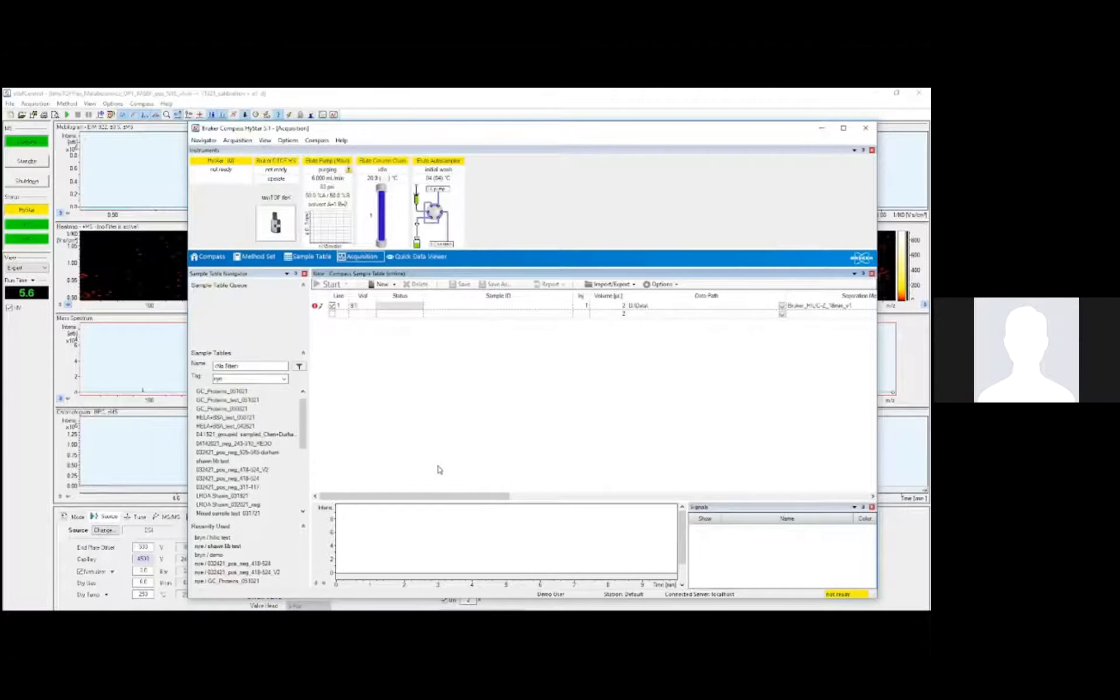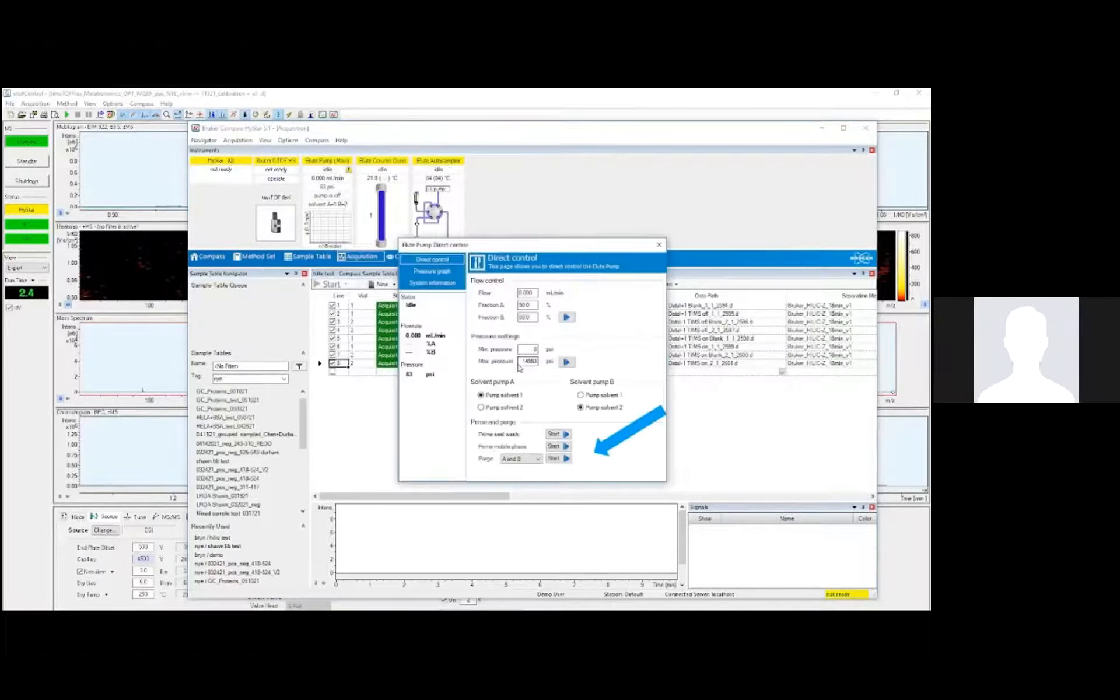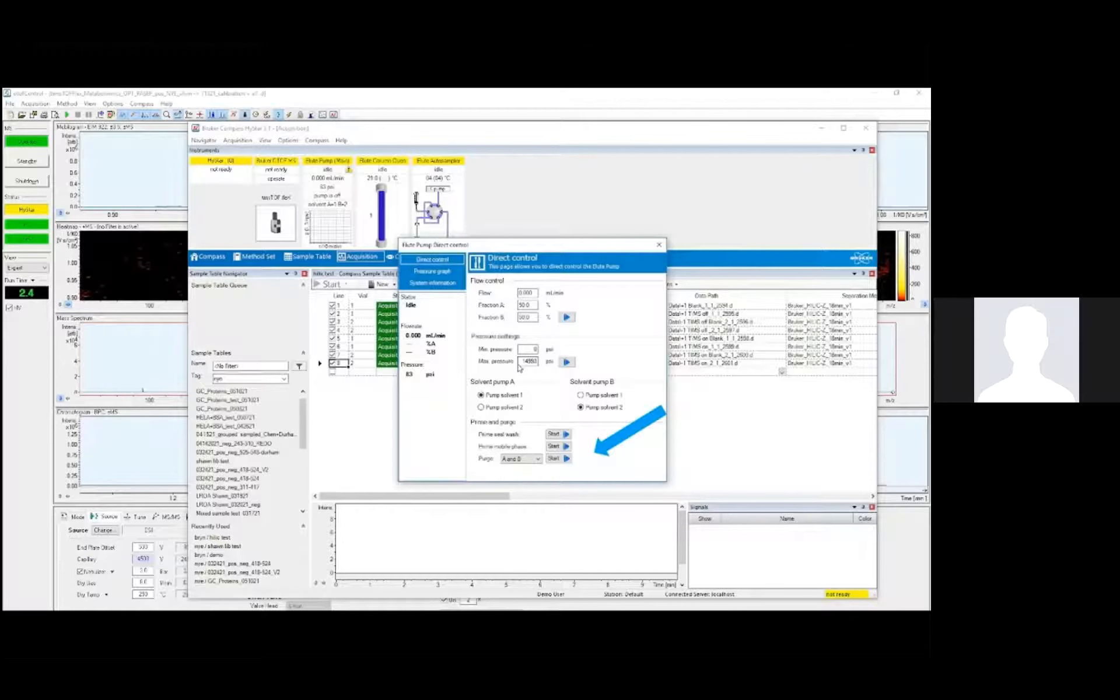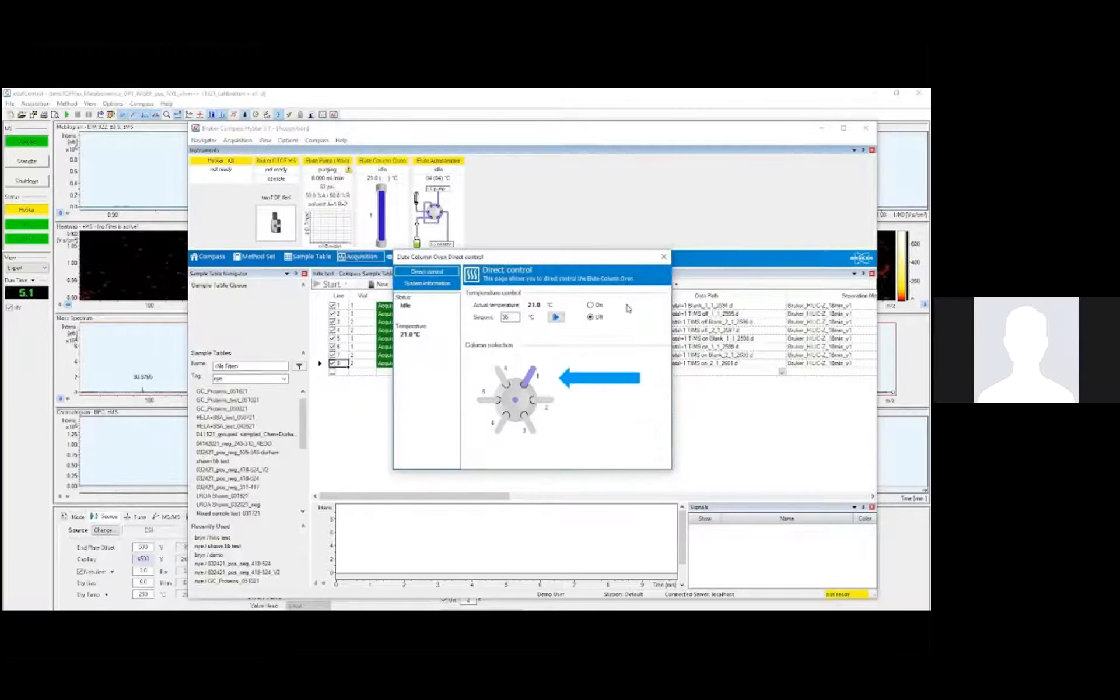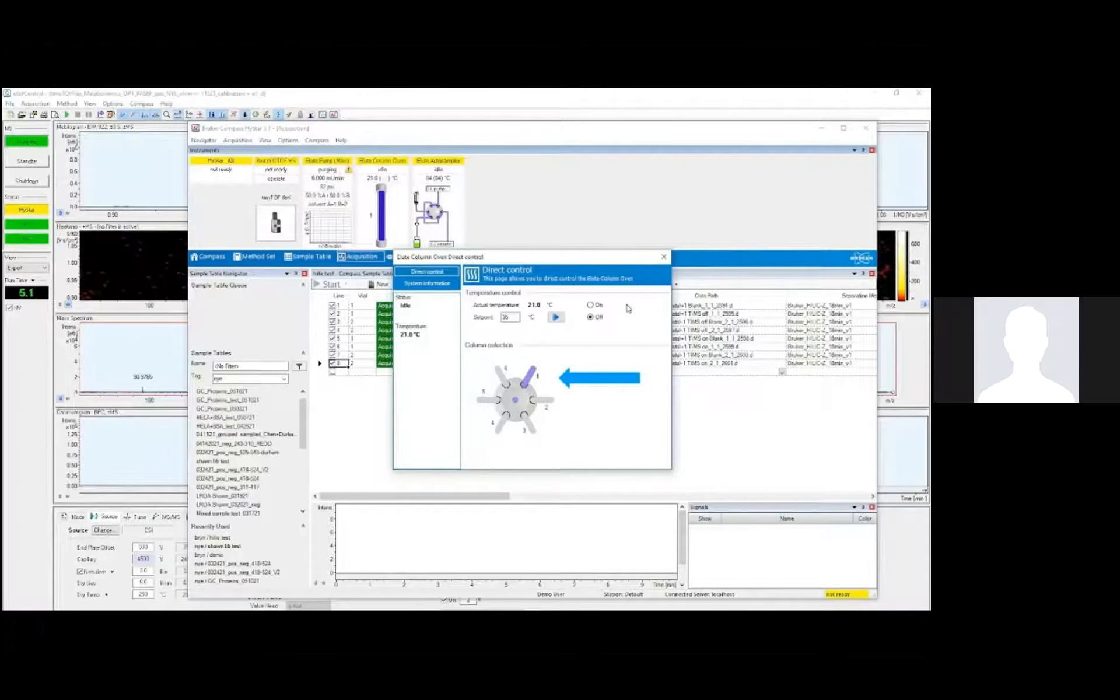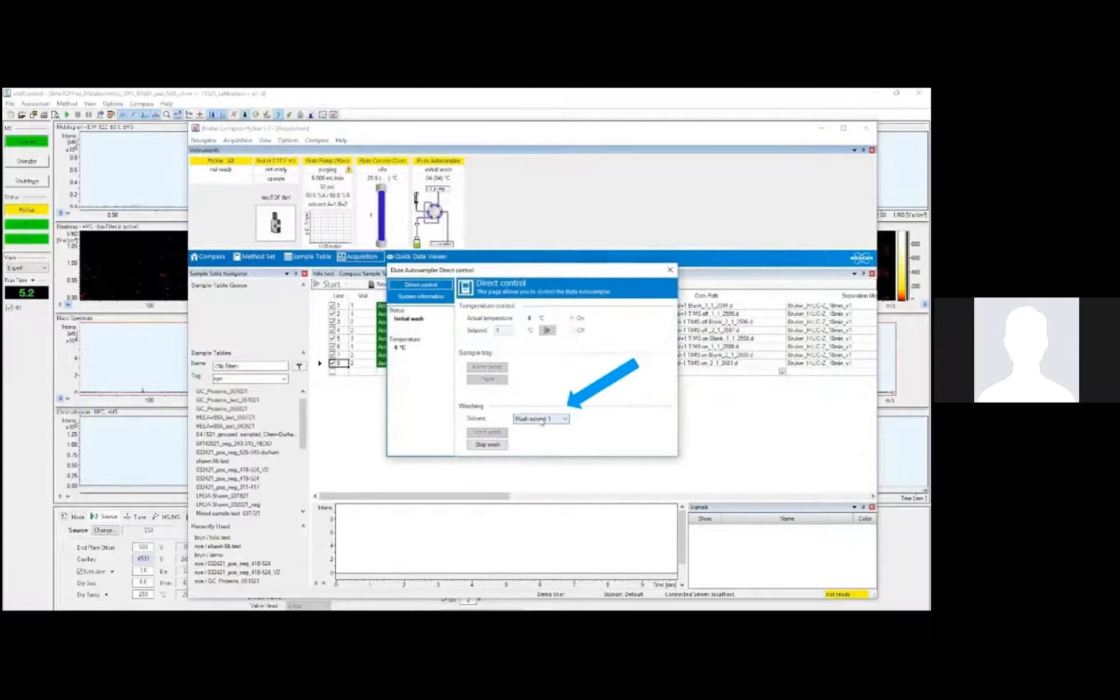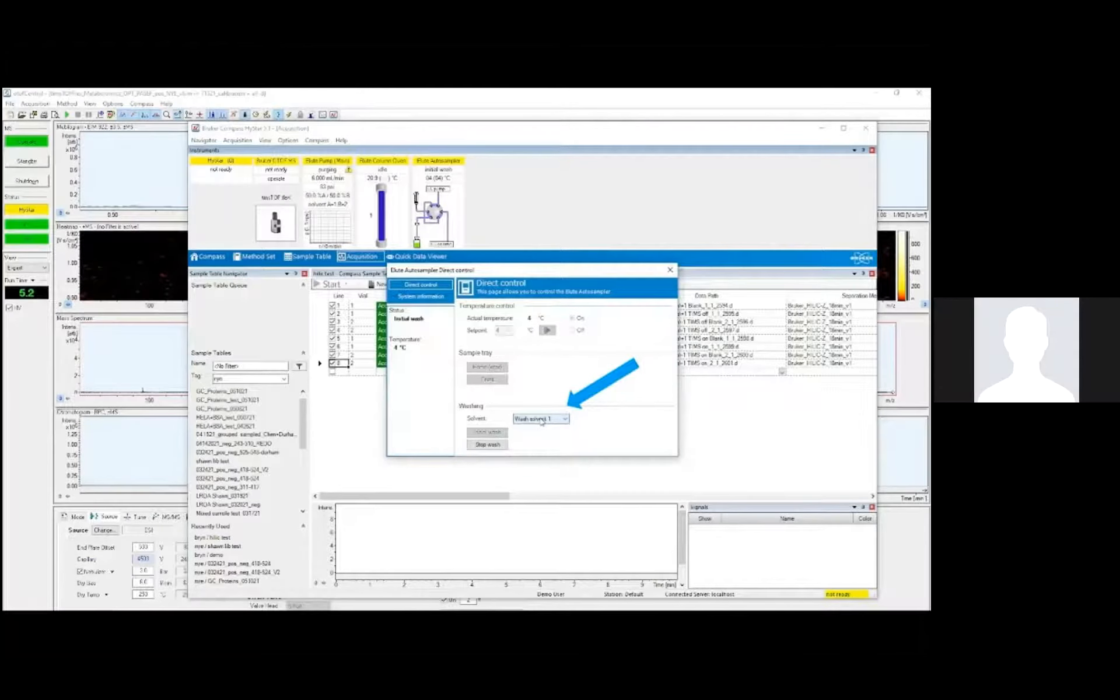I am now happy with the MS method and its calibration, so now I can move on to the acquisition software, HyStar. This interfaces with the OTOF control software, as well as the LC components. I'm starting by purging the pumps to remove air, and also doing a seal wash and priming the mobile phase. I need to select the correct column position, depending on which port I attach the column to. And next, I need to do some preliminary auto-sampler washes. I usually wash twice with each solvent.